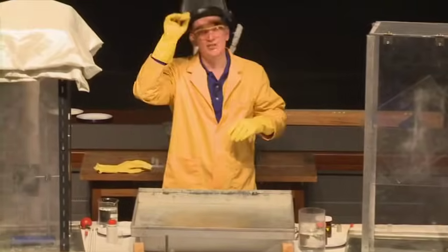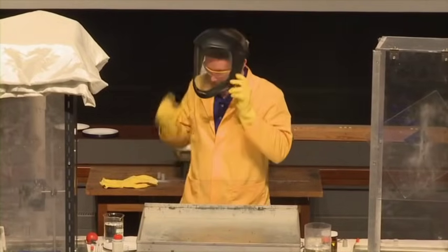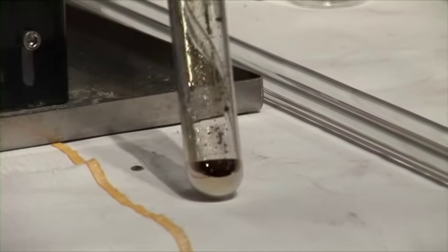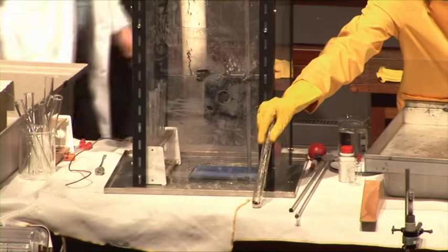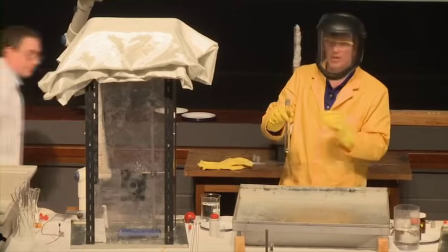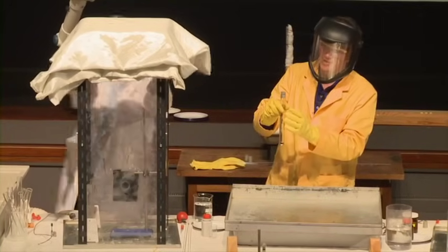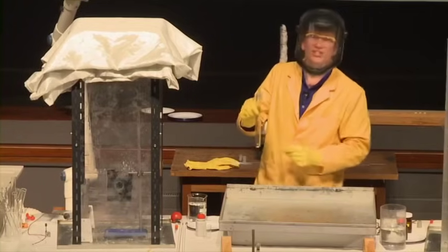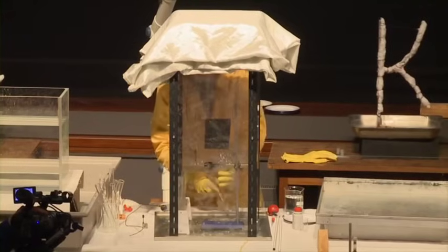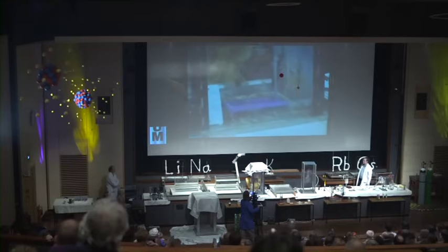We'll just wait for this to clear because this is a one-off experiment. The amount of cesium we're using is five grams and it costs several hundred pounds. So here is our cesium — there's quite a bit of the metal down in the bottom of the tube, and again it's under a blanket of argon, so it will not react with the air. The argon is heavier than air and will protect it until it comes into contact with the water. We've used the same quantity of every metal — the same number of atoms.